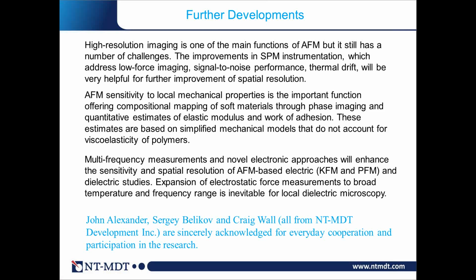from these elevated force measurements you probably can extract force versus distance curves to apply appropriate models. Is the Hertz model appropriate or is DMT appropriate? That again depends on how you perform experiments.